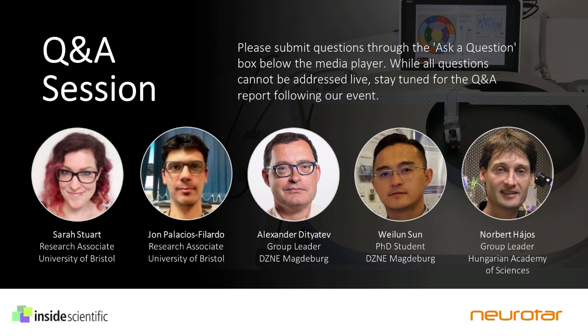All our training and recording sessions are carried out during the animal's active phase, so it's not something that we'd expect to see during our studies. But I would say that for anyone wanting to look at sleep in the mobile home cage, something important to consider would be the rate of airflow underneath the cage. You want the home cage to float easily enough so that the mouse can run around with minimal effort, but it also needs to be stable enough underneath them so that when they're not moving, it's not wobbling about, and it should allow them to sleep, maybe.